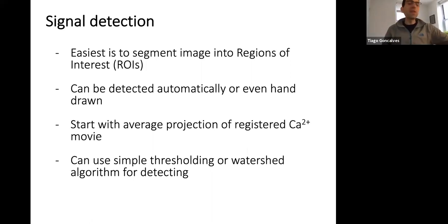the thing is that the option in ImageJ actually calls it Z stack. But it can be whatever stack it is. It's just that the other dimension is time here. It's a time varying signal, but you stay in the same plane. Yeah, I'm sorry, this is a little bit misleading. Okay.